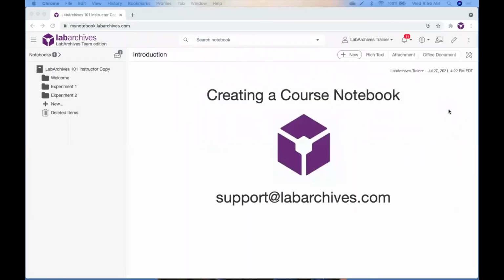Before you add students to your course, you will need to create a notebook with any data that you would like to share with your students. You can add instructions, lab protocols, schedules, videos, and assignments to the course notebook. Your students will receive their own individual copy of this notebook, and you can push out new course content throughout the semester.